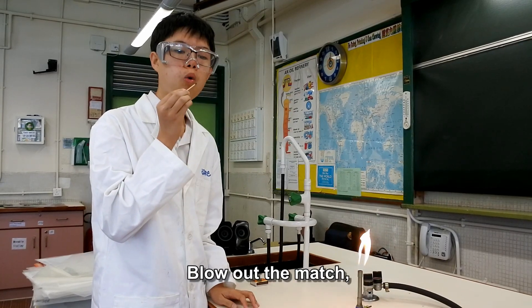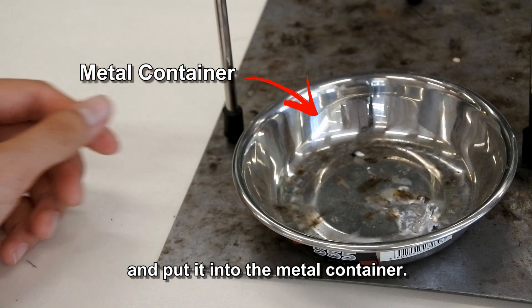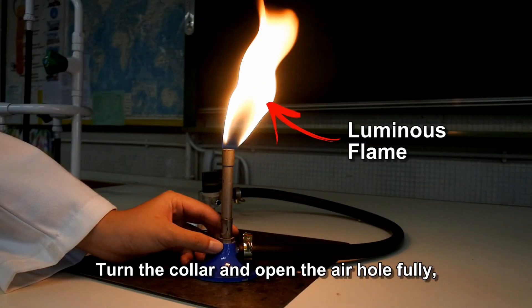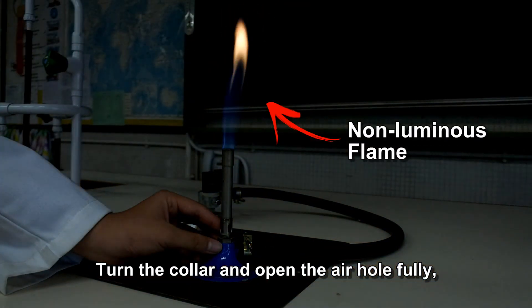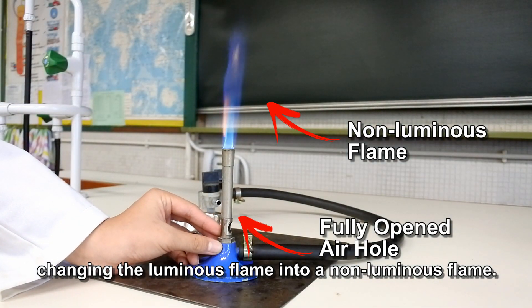Blow out the match and put it into the metal container. Turn the collar and open the air hole fully, changing the luminous flame into the non-luminous flame.